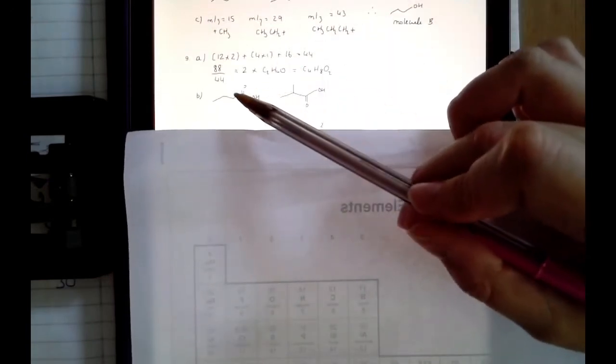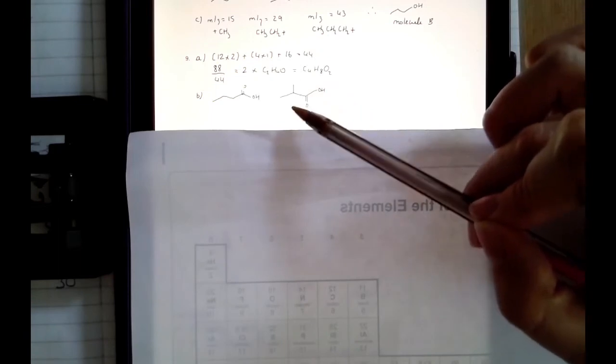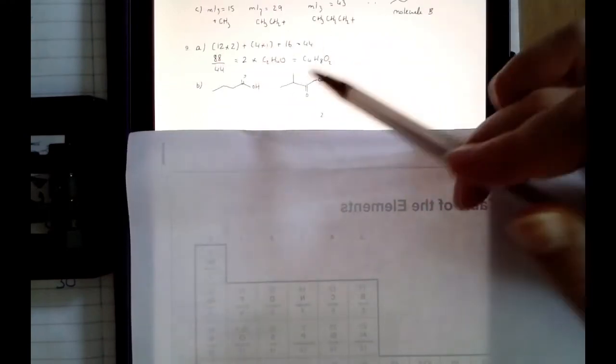And the last one I've got is m/z 43. This is something I'm familiar with. It is my C3H7. I could break this bond right here and get C3H7. I could break this bond right here and get C3H7. So both molecules are giving me that. So again, it's this middle peak here that is unique to just my butanoic acid, okay? I can't remove something with a mass of 29 from my other acid, therefore I do not have a peak with 59. Therefore, molecule C is going to be butanoic acid.